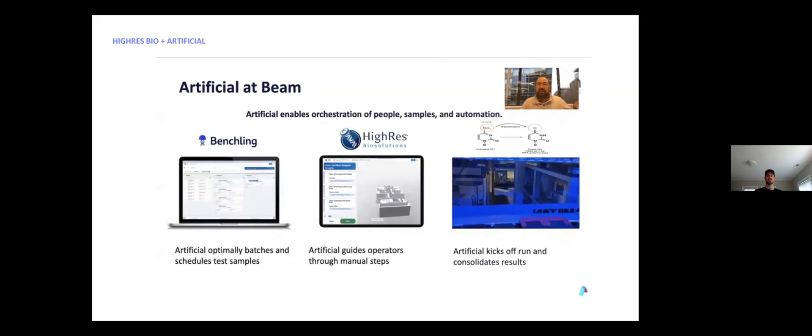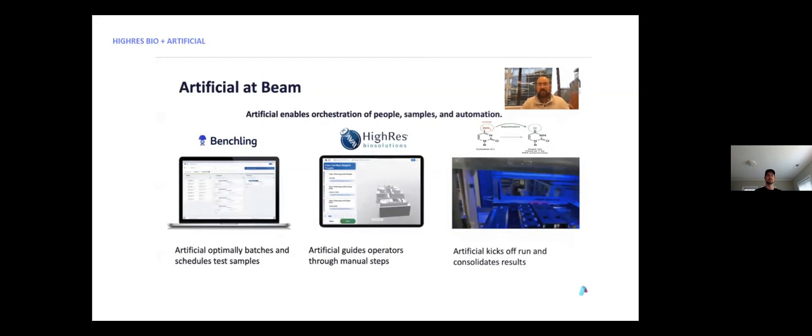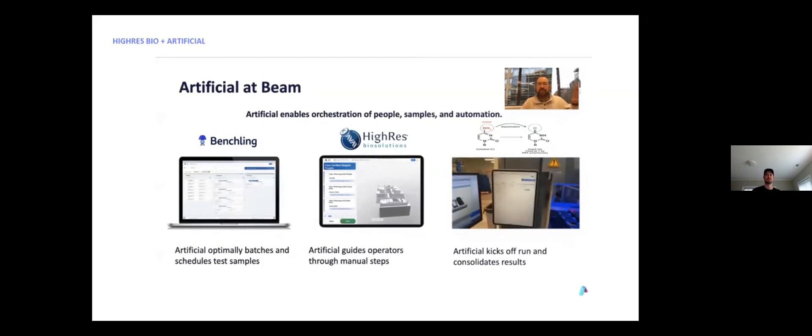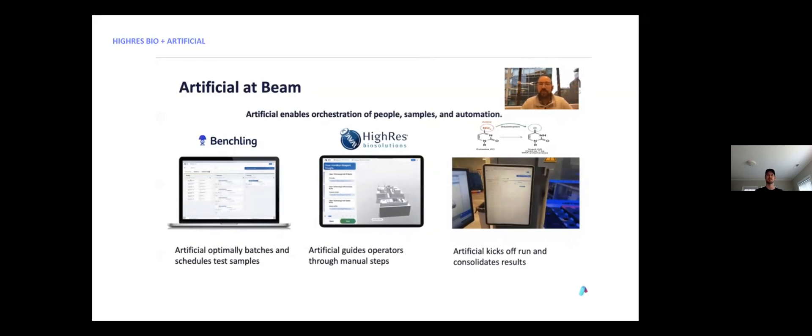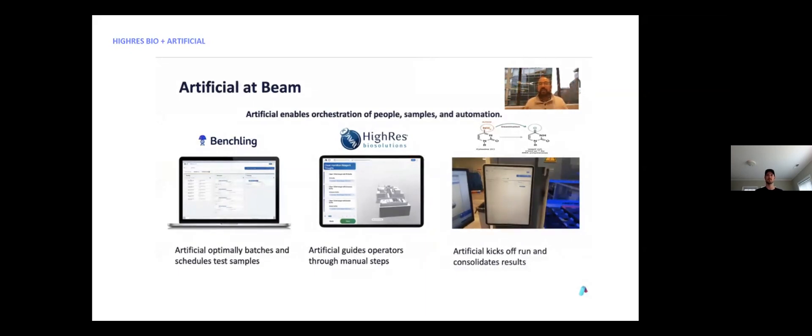So as orders are placed in Benchling, they seamlessly sync to A-Lab. As they're batched within A-Lab during the ops process, all of that is fed back in a continuous loop and connectivity to Benchling so that then order statuses are changed, inventories changed, metadata is tracked. It then connects seamlessly into our Hi-Res Solario system and places that order for us so we're not even having to go into Solario.